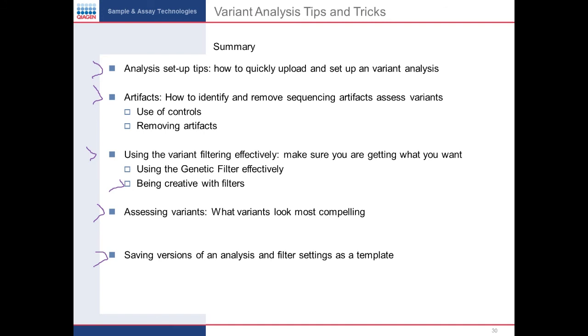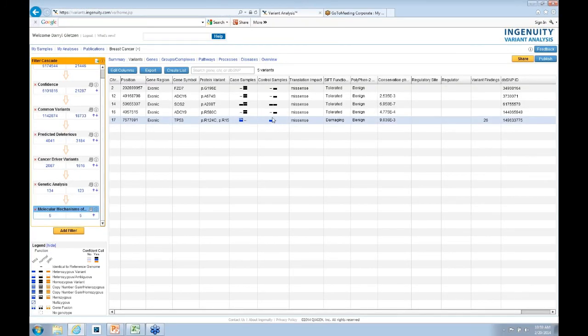And normally when I do a tumor normal analysis, I will usually have them paired. So I know I took the pairing off of here. I don't necessarily recommend that. I just did that for display. But normally I would leave them paired, and then I would say, well, show me what's in my tumors and not in my controls. But if your scientific question is like I had done here to ask, well, what variants were in my controls? As we saw that predisposing P53 mutation back here, which was in my controls, then again, it's just a tweaking of your genetic analysis filter to ask that question.